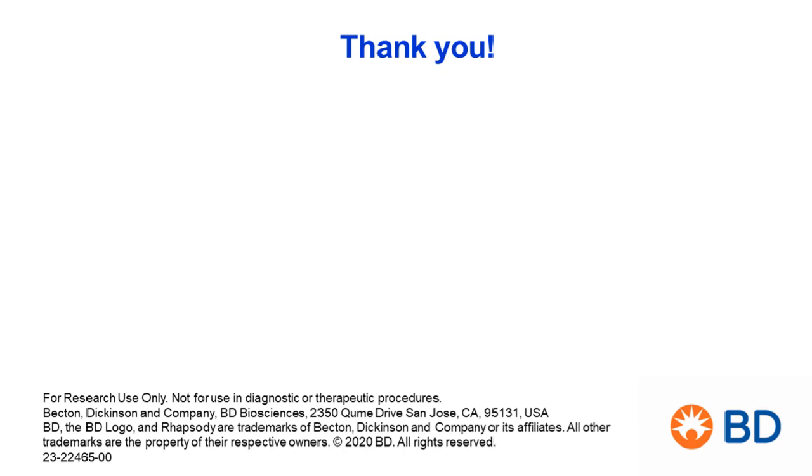You can perform just with a minimum number of antibodies if you can. We have done that as well. And of course, I don't know whether that is what the person that asked this question was referring to. You can also go back to individual omics, of course. The point of this, however, was that you could combine these two technologies together, and you can be flexible on the type and numbers of antibodies that you use to stain the cells before Rhapsody. So hopefully this will answer the question.